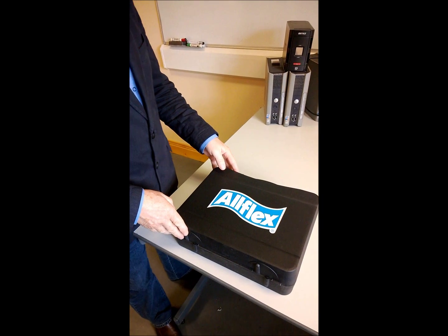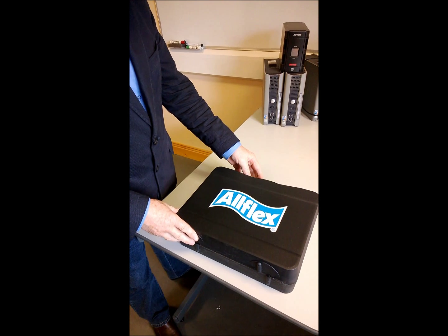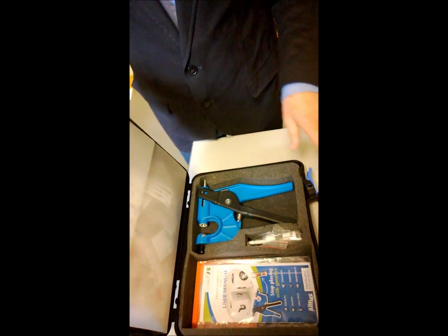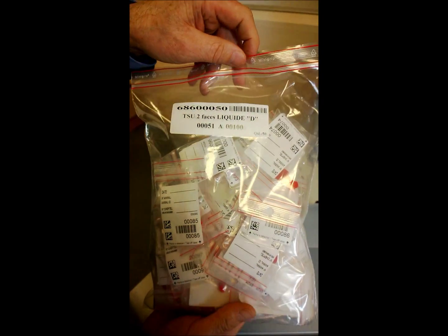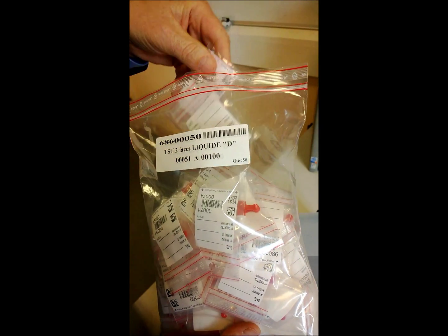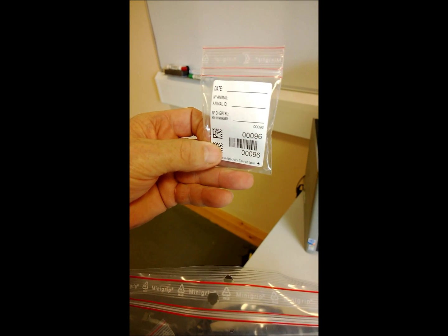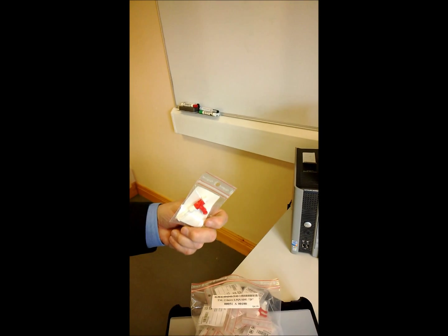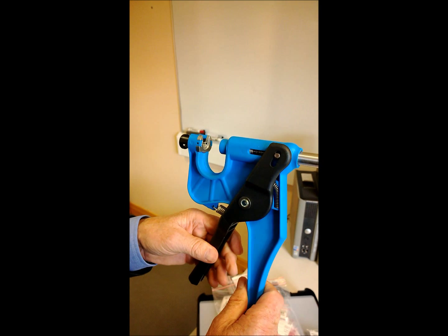If we're going to take a sample of tissue for the dairy genomic program, this is the case that will come. The applicator will be inside together with the tissue tubes. We open the case and we have our gun and our tubes - 50 to a bag. The tubes are in individual plastic bags and the individual number of the animal is on those tubes and on the outside of the bag. The gun does not leave a tag in the ear.